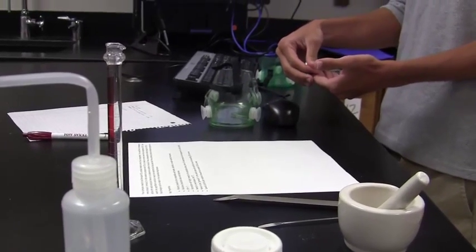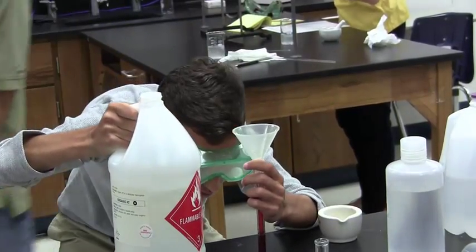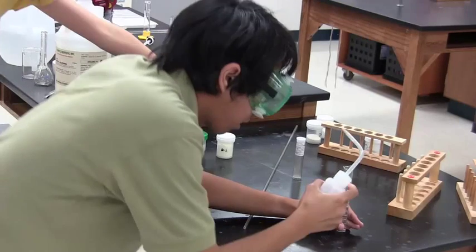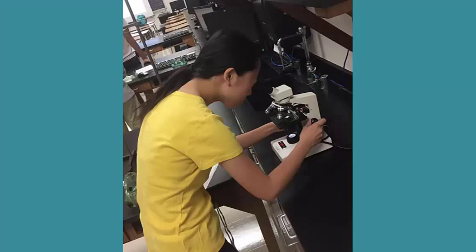Okay, so what we're doing here is we're comparing the particle size of our substance D3 with the substance XYZ. The way we're doing this is we're going to grind them both up into the smallest particle size we can get them with the mortar and grinder right there. Then we're going to take it under the microscope, compare the particle size, and that will allow us to effectively compare the structure of the two compounds or the mixtures that are in our substances.